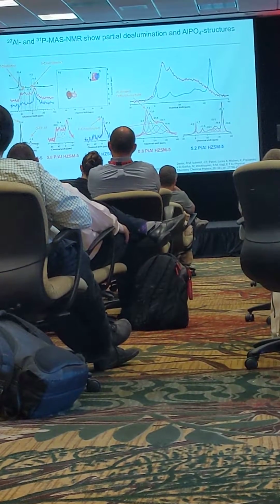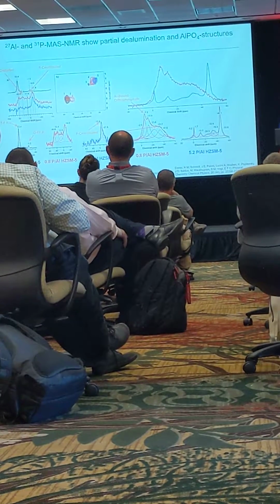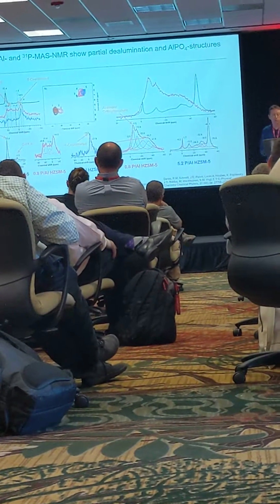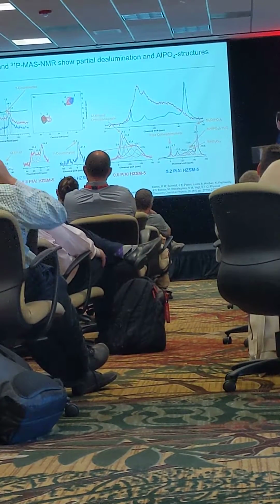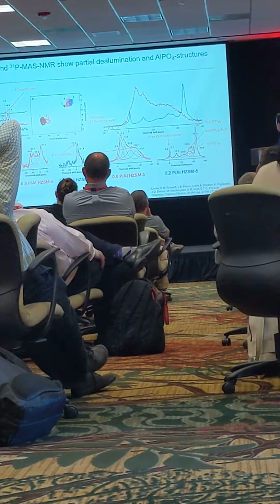On the right-hand side, we've got the phosphorus-31 NMR data. It shows us aluminum-bound orthophosphate, some extra framework AlPO as well. And look at the dramatic shift again when you go to the high phosphorus loadings. You've got this shape, the peak is of course very dramatic, dramatically different.